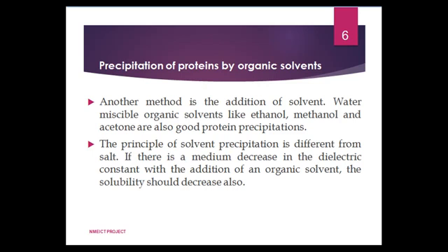The principle of solvent precipitation is different from salt. If there is a medium in which the dielectric constant decreases with the addition of organic solvent, the solubility also decreases, and hence we can expect precipitation of proteins.